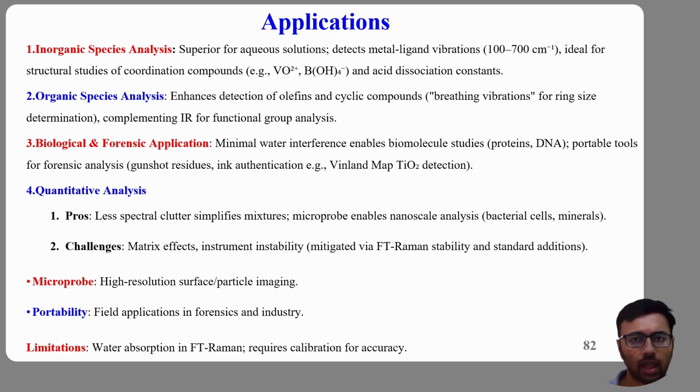In forensic science, portable Raman spectrometers allow investigators to identify narcotics, explosives, toxins, and hazardous chemicals without opening the container. The laser can analyze materials directly through plastic bags or glass bottles. This minimizes contamination and improves safety.